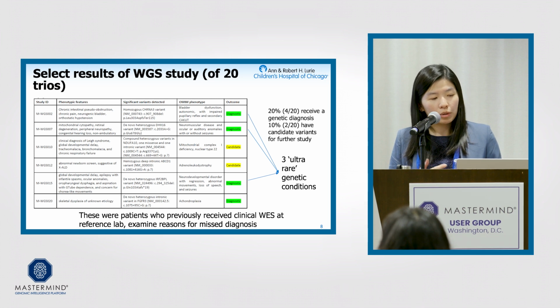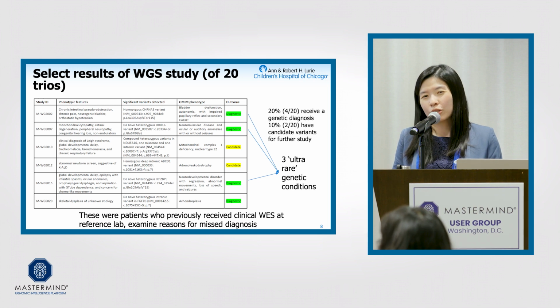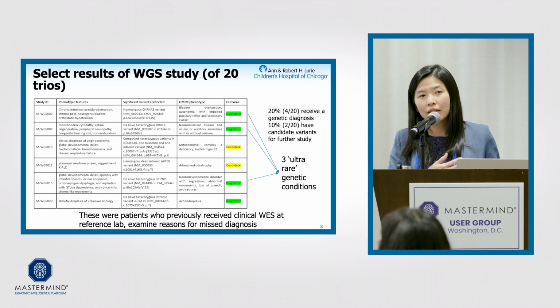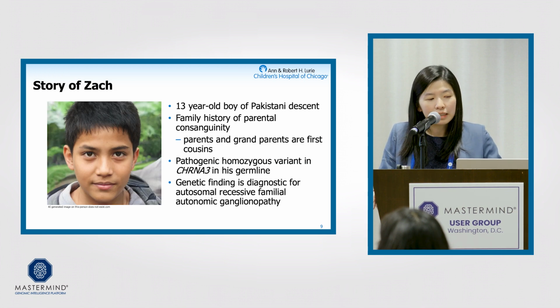But going through this, we were surprised, right? These were undiagnosed exomes. Now, how do we manage to find something? And really looking at what were the reasons why they were undiagnosed by exome, and how come genome managed to answer that question, right? Or did genome actually contribute any component to that whole equation of finding answers for these patients? Because I do believe that if you examine the fail points of how things had occurred, you'll be able to improve your own process, even though it wasn't our process, right? Examining what could have happened can really improve the analytical pipeline for whole exome and whole genome sequencing.